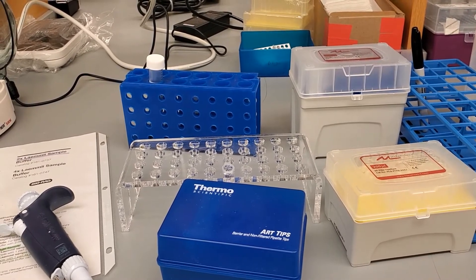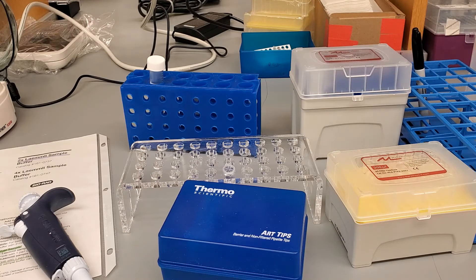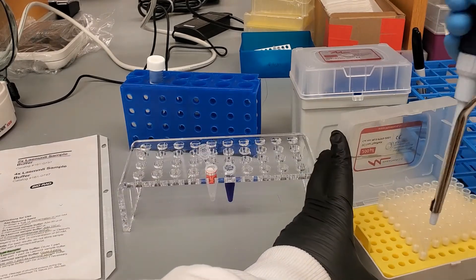Here I'm going to prepare my second sample. I already did my calculations, which I showed you. All I have to do now is add my 4X Laemmli — which has the beta-mercaptoethanol — and the RIPA buffer to bring it to the desired volume of 25 microliters per sample per well. In my case, I'm going to add 23 microliters.